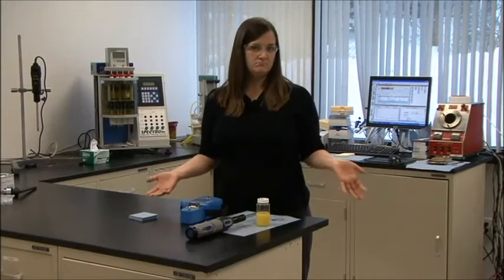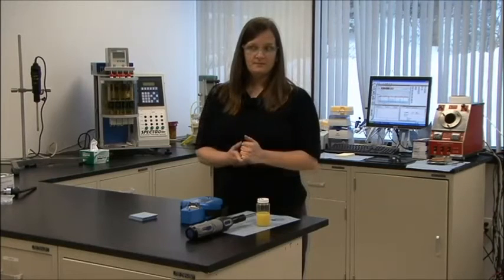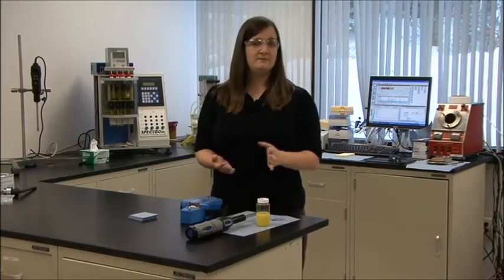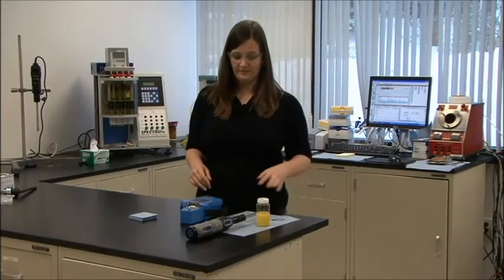This is compared to the Karl Fischer measurement, which can take anywhere from five minutes to a half an hour, depending on the amount of water content that's present and the specific model of Karl Fischer titration equipment that's used.